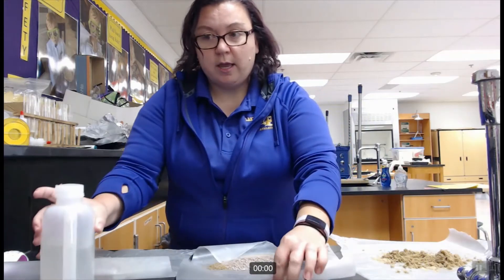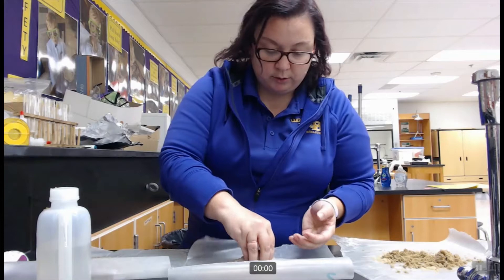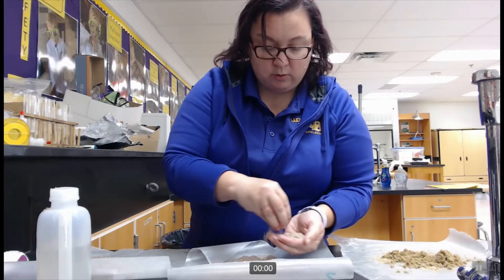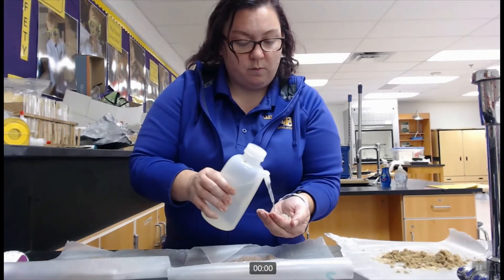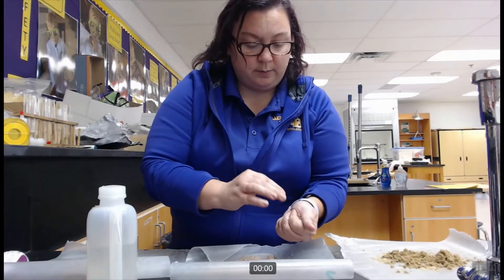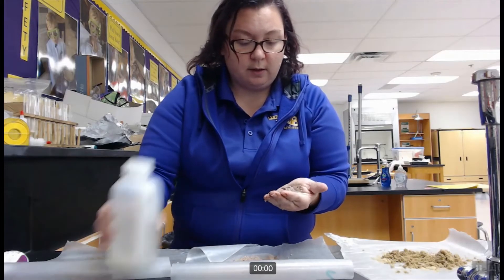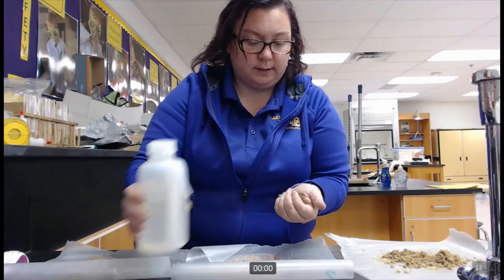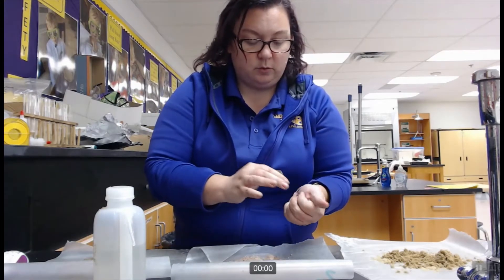Looking at our second sample, I can see my particles are quite finely ground so there aren't any large chunks. I am going to moisten and knead this sample. This one does have a few more chunks in it so it needs a little bit more kneading in order to get it to a smooth consistency.